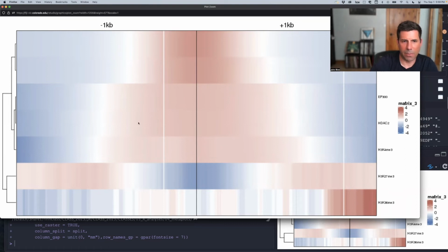And so you can think of this as the same line plot, just as a heat map. Where there's more density, it's more red, and where there's less density, it's blue. And we normalized it so that we could say where the density is above average and below average for my DBP, because the peak files could have different properties. So we normalized each of these rows, even though it was tilted as a column when we normalized it.